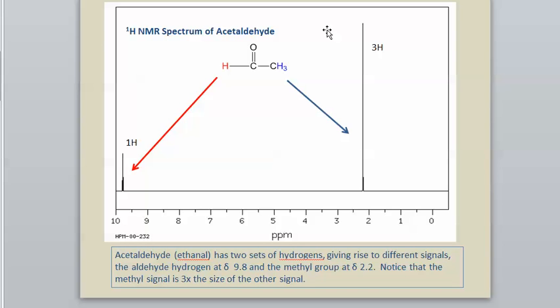What's actually being calculated when this is run by a computer is the area underneath these peaks. They look like single spikes, and sometimes the peaks will be broader, and it's not just how tall they are, it really is a matter of the area that's encompassed by the peak. But that's done by the NMR spectrometer, and so that kind of information is given to us when we're trying to, again, work through examples like this.